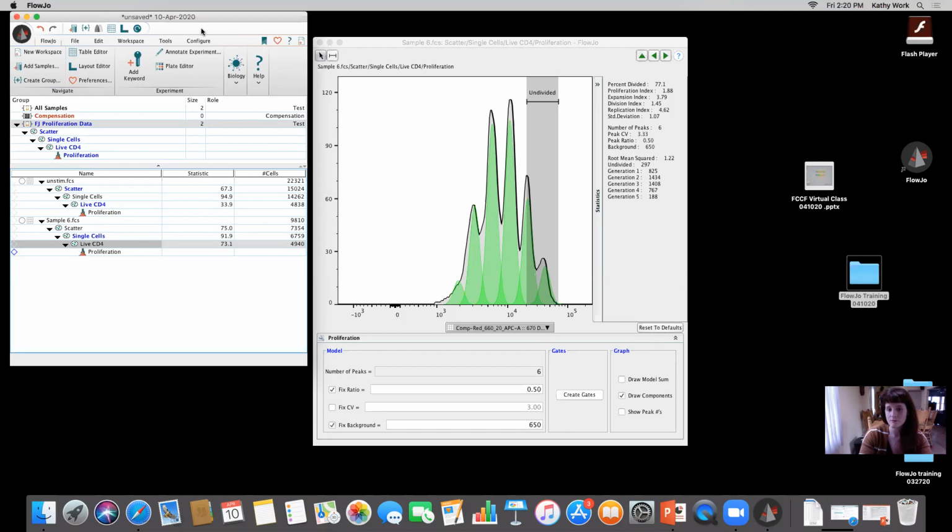Yeah. But if it's something that you can improve in your sample prep, and even during acquisition, then definitely it's much more important to focus on that and get better data, than to try to model bad data. Let's put it that way, right? Because the models have their limitations. Limitations, exactly.